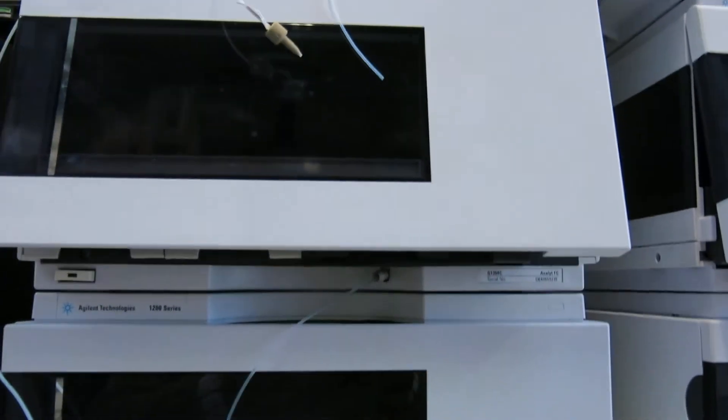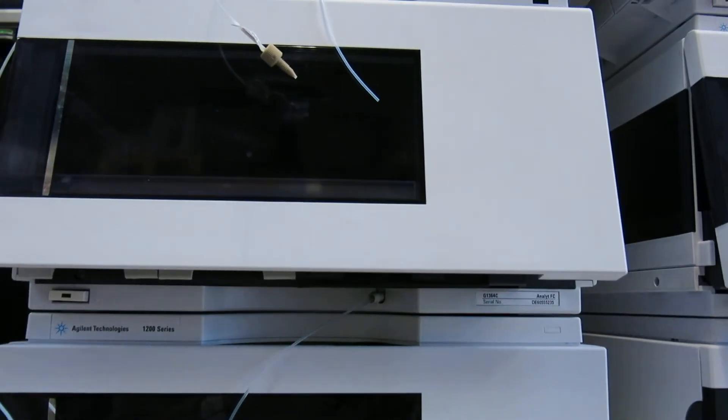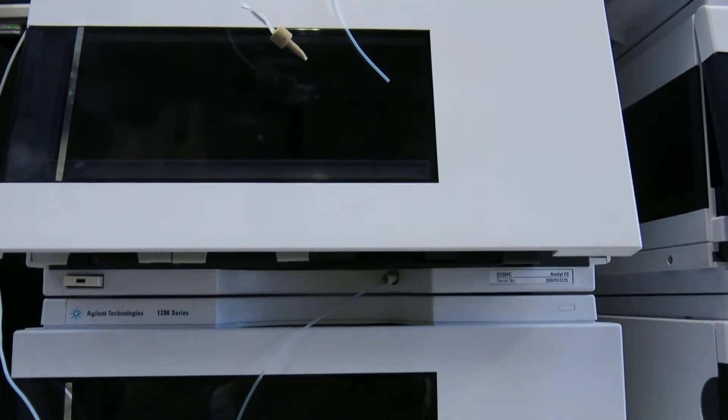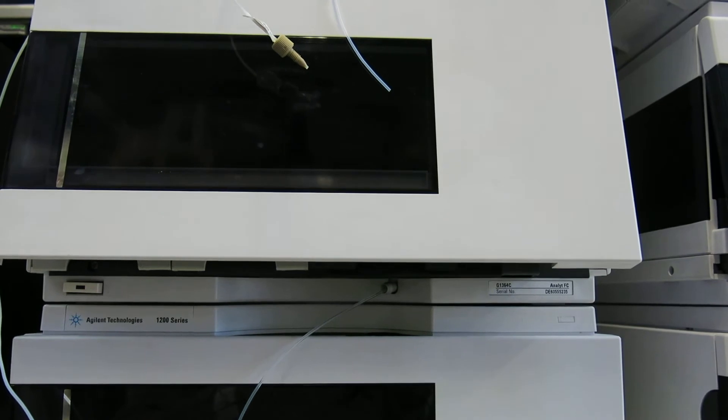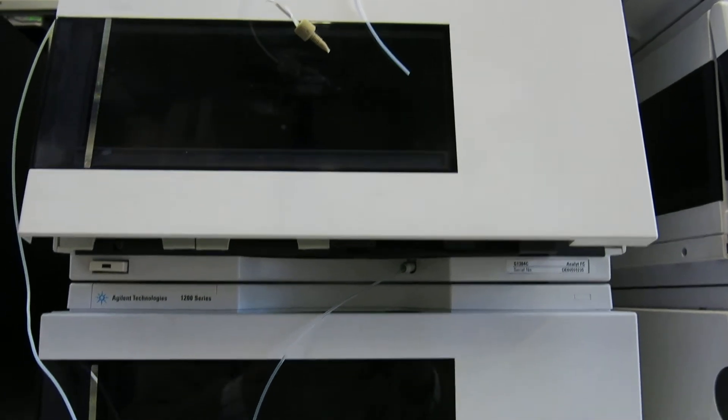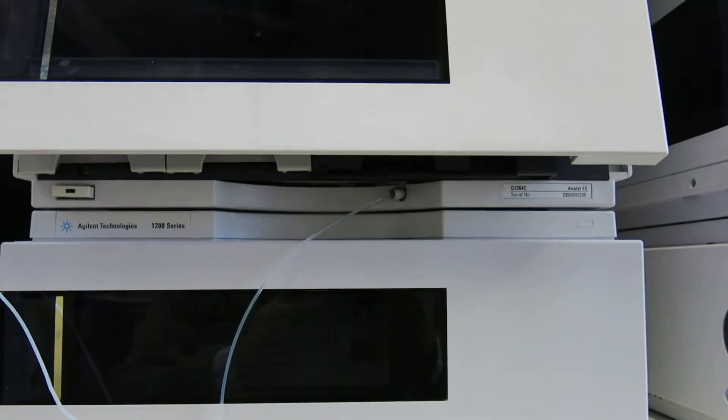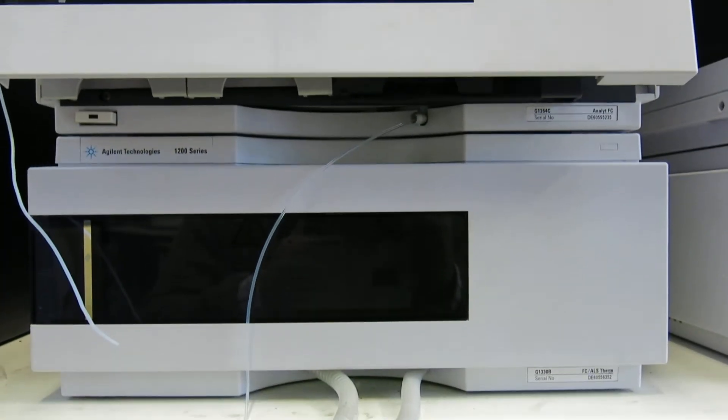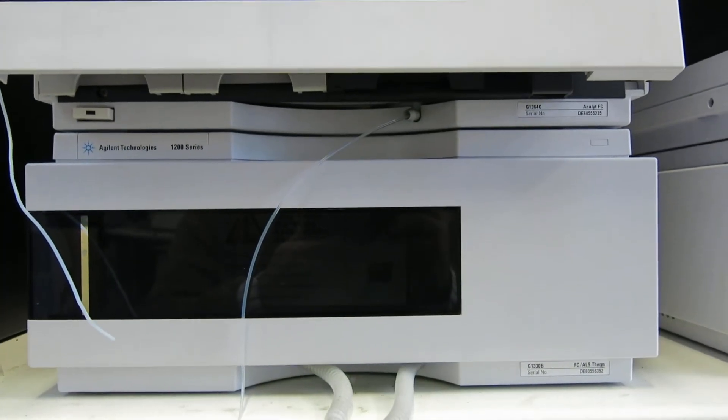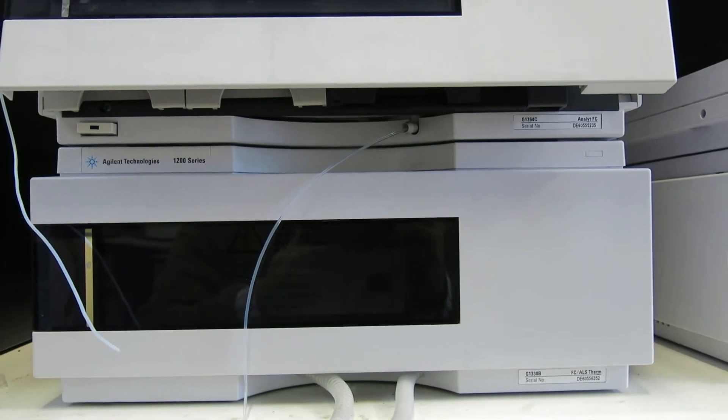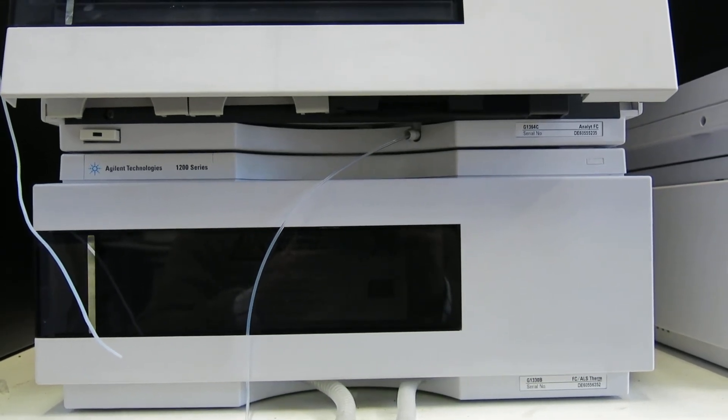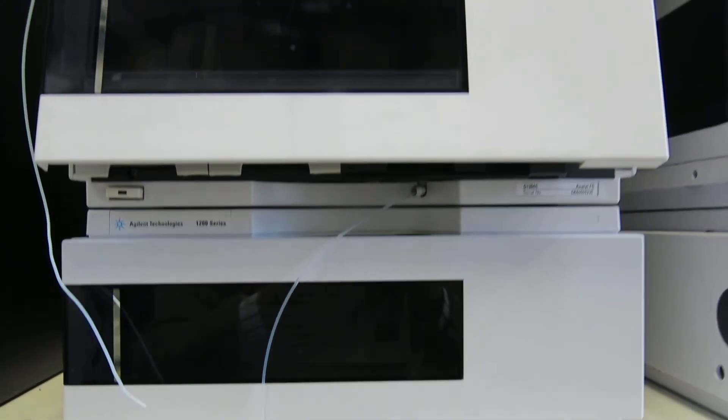We've then got the analyst FC which is a G1364C. And then we've got the FC ALS Therm which is a G1330B.